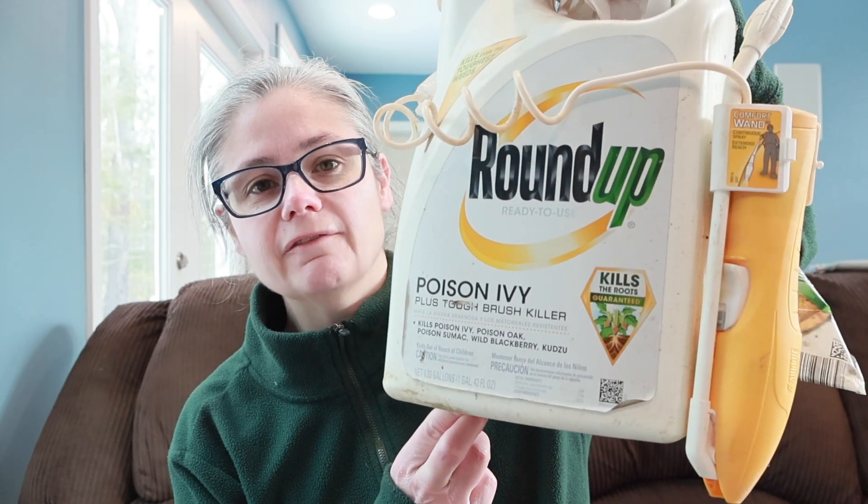In addition to testing the fruits and vegetables, I found some Roundup poison ivy spray in my shed — I really don't remember ever using it, my husband must have bought it. Now I know this is not technically a pesticide, it's an herbicide, but I am going to run a test on it just to see if I can get that color change. I'm curious to see if something like a poison ivy spray would show up on this test.